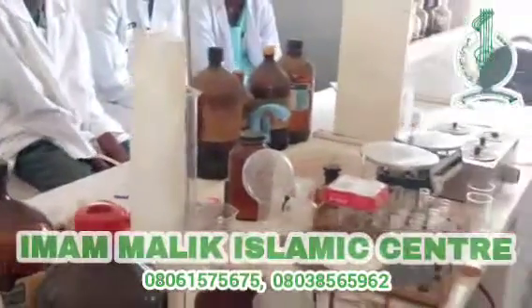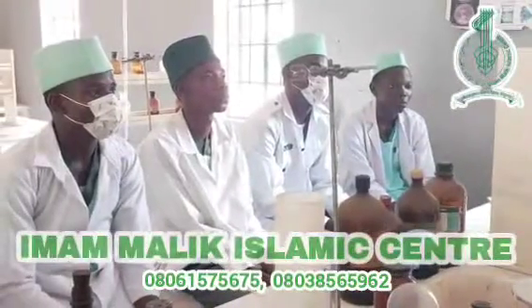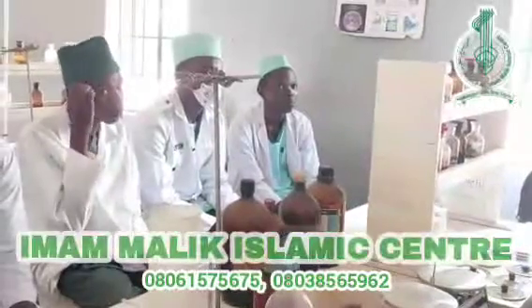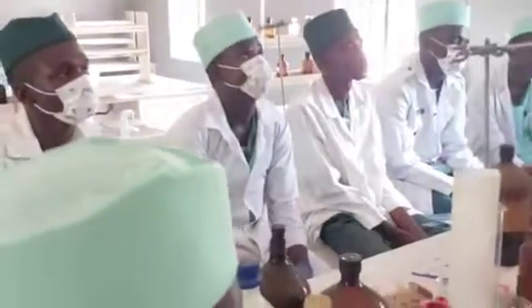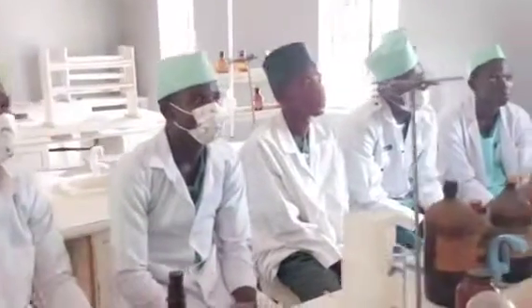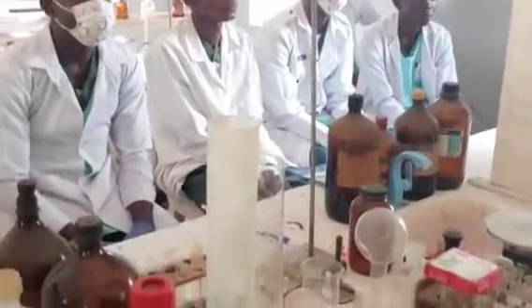Why? Because if you are in the lab, maybe you have touched one or two of the chemicals, and when you apply your hand to your face, you don't know which type of chemical you have touched, and you are now introducing hazard to that part of the body. And food or any drink, either open or closed, should not be brought into the lab.